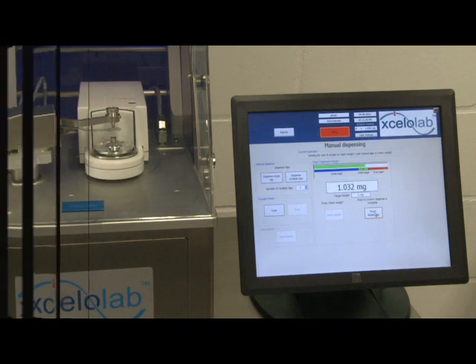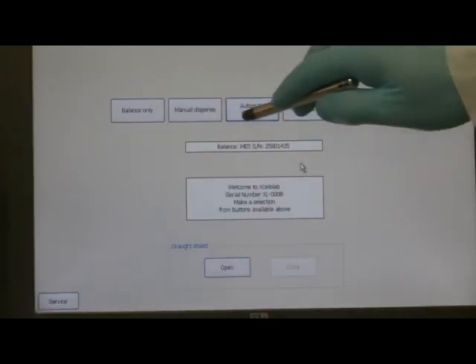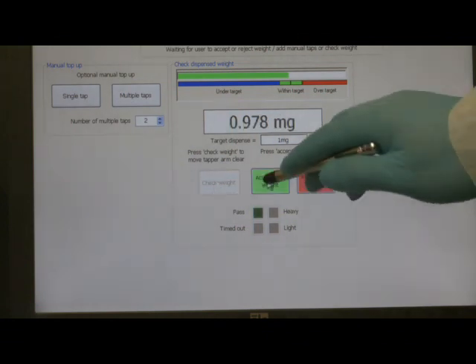The automatic dispense mode enables the accurate dispensing of powder into a suitable receptacle. The automatic dispense method is selected and the dispense is performed automatically. The HMI shows the dispensed weight. As the dispense progresses, the color indicator bar changes from blue (under weight) to green (within weight). If the weight is over the desired limit, the color indicator bar will show as red. The weight is checked and further manual dispenses can be performed if required. The dispense is then accepted.